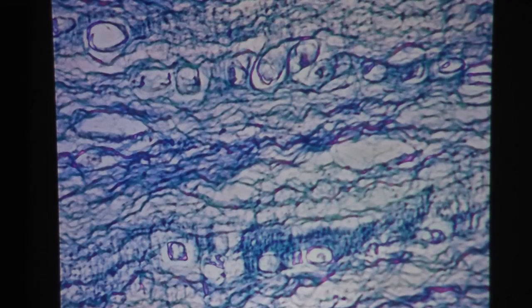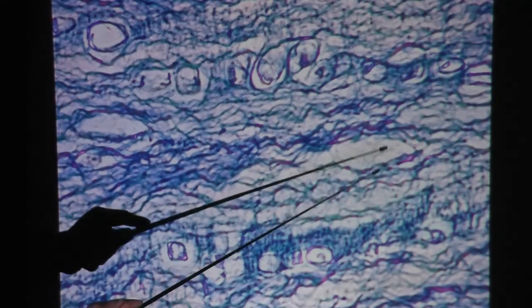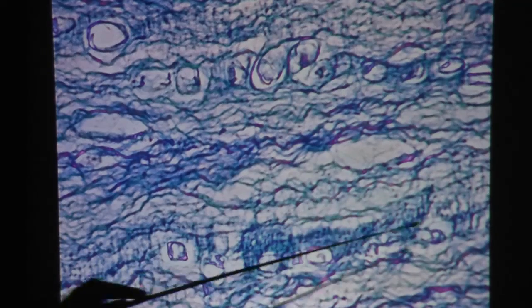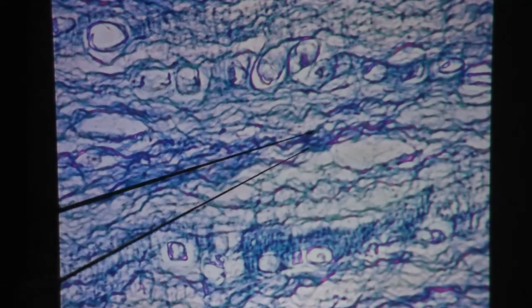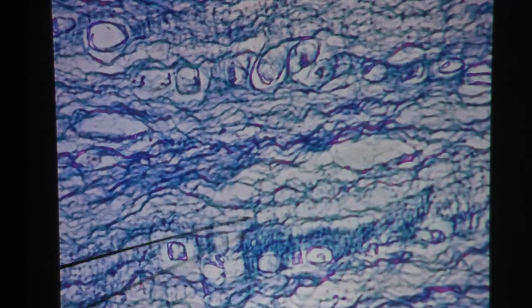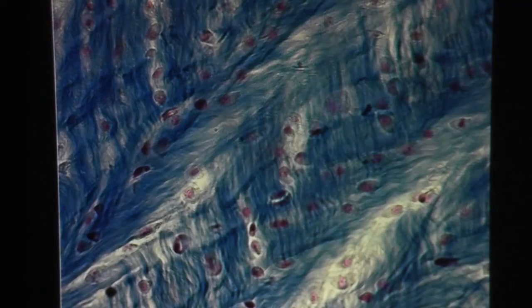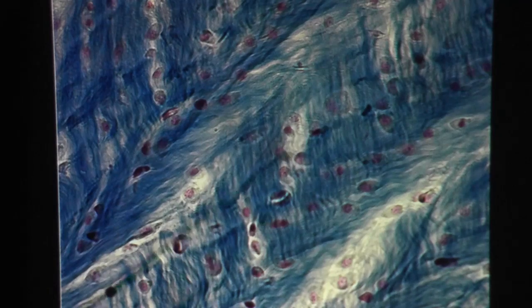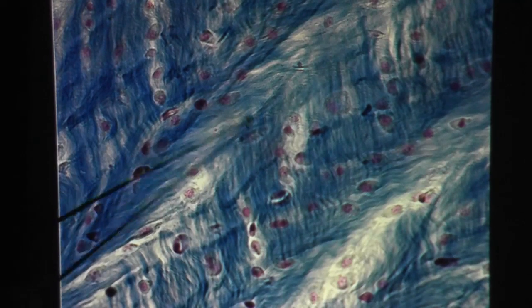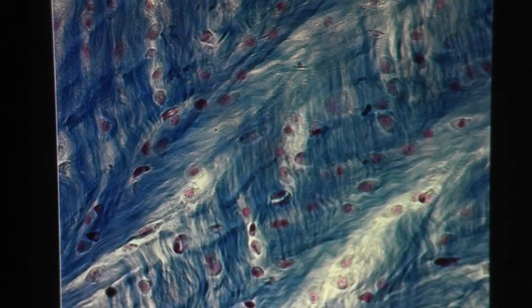Here's another look. The waviness of collagen fiber is very long. Most of these waves can be running in the same orientation and direction. You also see these big cells — chondrocytes in lacuna. Another view: lots of chondrocytes in lacuna, and lots of waves — that collagen fiber confirms this is fibrocartilage.